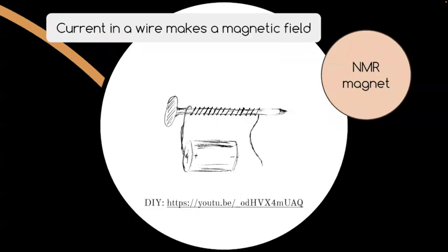How do you make a magnet? Well, a lot of you, when you weren't doing iron filings, perhaps were making magnets by wrapping copper wires around nails. If you take a copper wire and make a solenoid around a nail, just like shown in this drawing, and attach one end to the positive pole of a battery and the other end to the negative pole of the battery, you've got to be careful.